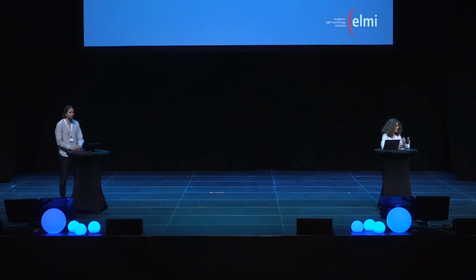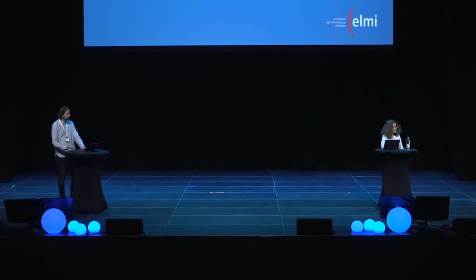Hi, Anna, great talk. My question is regarding the enhancer network. I guess from a user perspective, the user never knows how much annotation they need to give in Ilastik for the random forest to generate a statistical map that is good enough for the enhancer to go on. Are there ways to actually know how quality control scales with annotation? Is that something that the user has some perspective on?